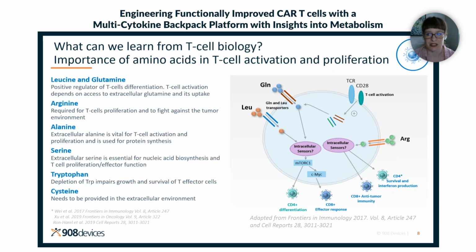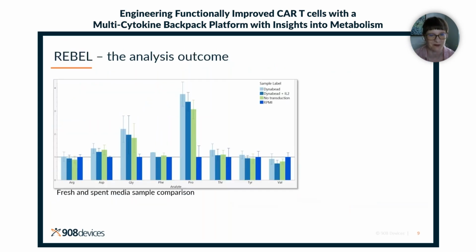Now, highlighted here are just some key findings from previous literature on why amino acids matter and why including spent media analysis might provide you with more insights into your process. Choose your favorite amino acids. Which one matters to you the most? These were just the highlights.